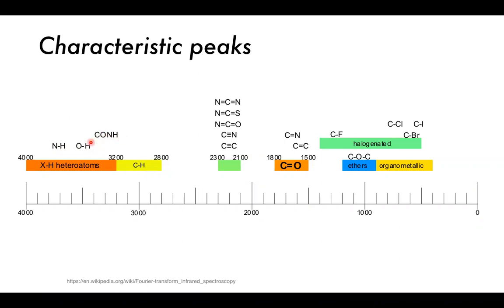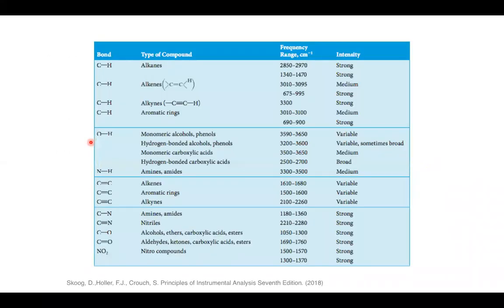So these, especially the OH peaks, we saw before at the very beginning of this, where I introduced you to some water spectra in the gas phase and also in the bulk, and how those could be very broad if they're in the bulk, but we saw well-resolved peaks whenever we used gas phase water. Now the XH heteroatom there is the OH bond in water, and so it's very visible and easy to determine.